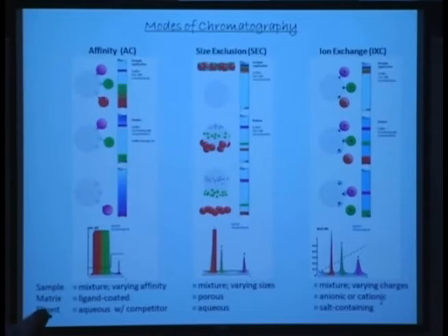In this particular case, there are 3 molecules, one with only 1 negative charge, one with 2 negative charges, and one with 3 negative charges. So depending on the number of charges, the interaction probability is going to be much, much better under appropriate conditions, typically under low salt conditions.